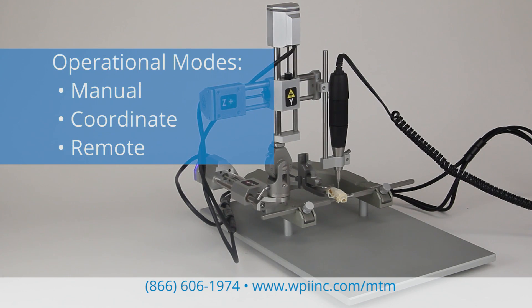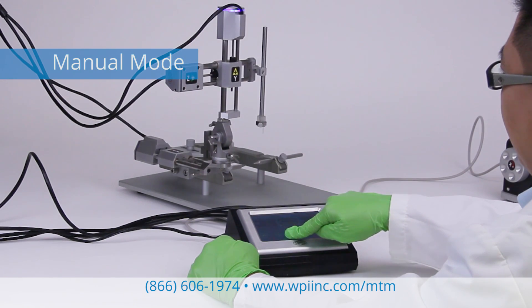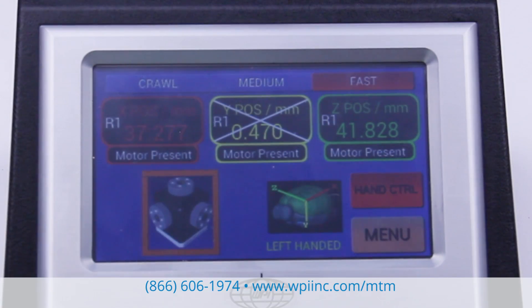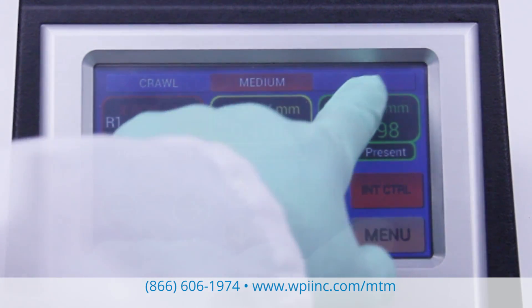This motorized stereotaxic frame has three modes of operation. In manual mode, you can move the actuator using the touch panel or the hand controller. Enable or disable individual axes with the touch of a button. You can easily select your speed of travel between two and two hundredths of a millimeter per second.